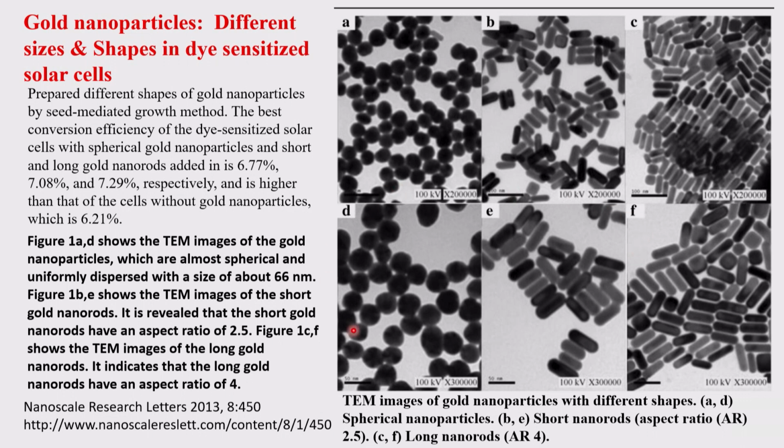But this you are seeing because you have taken a transmission electron microscope. This is not just a picture using a camera which gives the light. Okay, so that means you are able to see the materials along with their shapes as well. And these materials are, as you will see in a while, in the nanometric size, a few nanometers to about 100 nanometers in that range, etc. So not much greater.